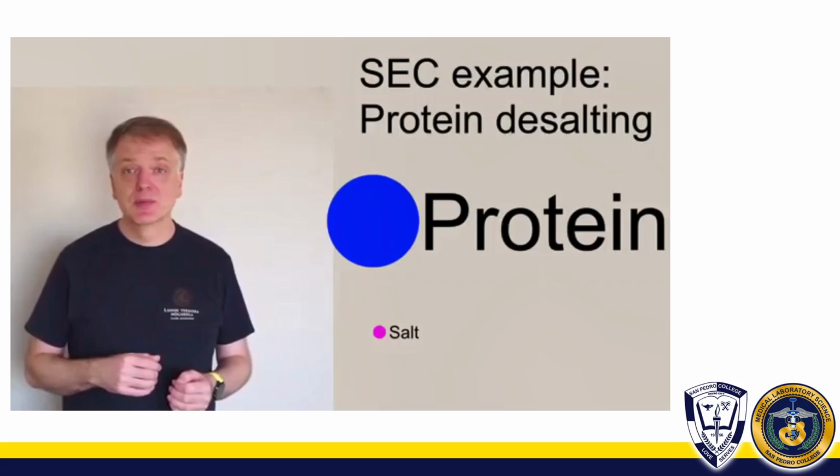Maybe you will ask, ma'am, what is the residence time they mentioned? Residence time here is actually the same as the retention time or retention factor that we defined a while ago. So the video pointed out the difference between size exclusion chromatography and adsorption chromatography.